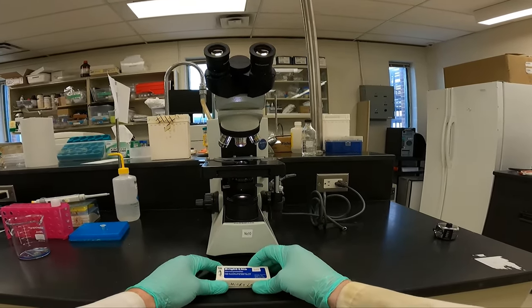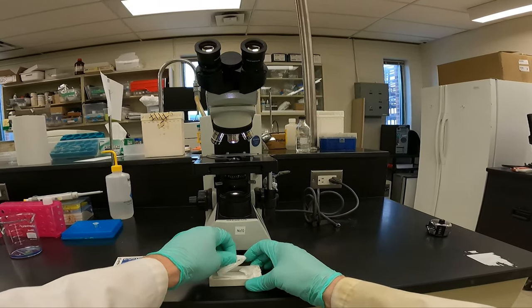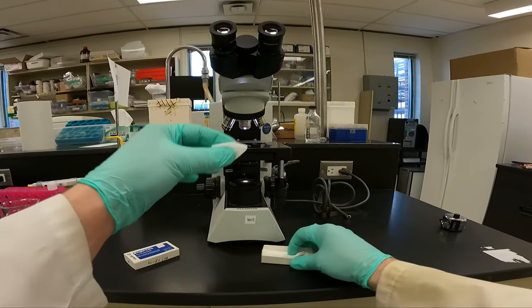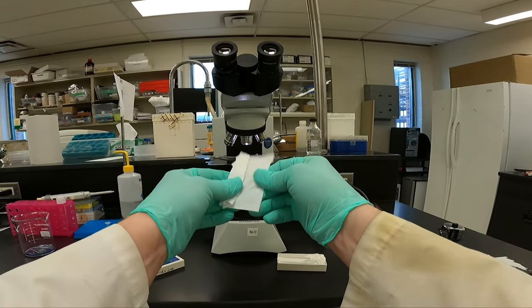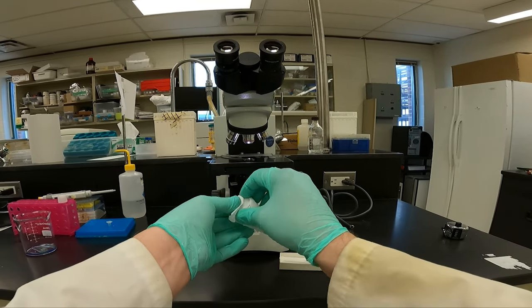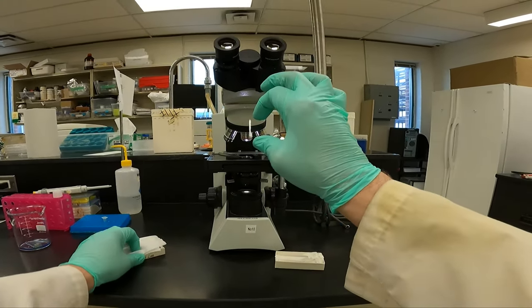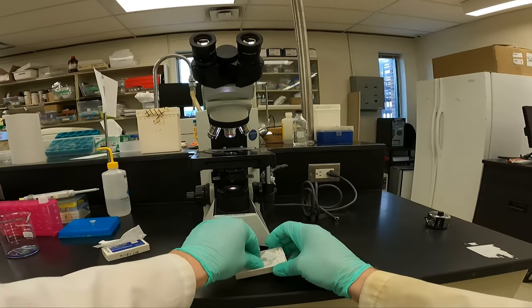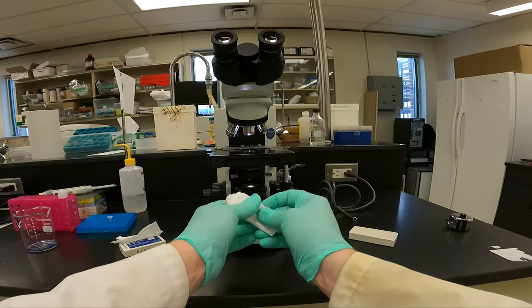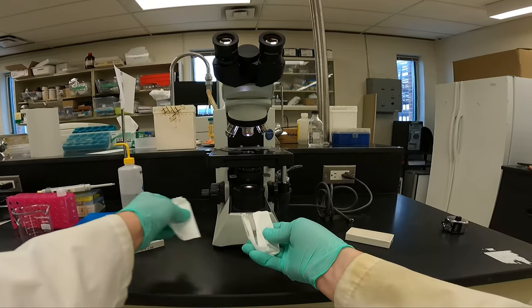Here we have our hemocytometer. It has a laser etched grid on it. And we'll use that to count ourselves. Inside, you'll find two things. You'll find a weighted coverslip. This is different than a coverslip you'd use for a wet mount. It is heavier. Please be careful with it. It's a bit expensive.